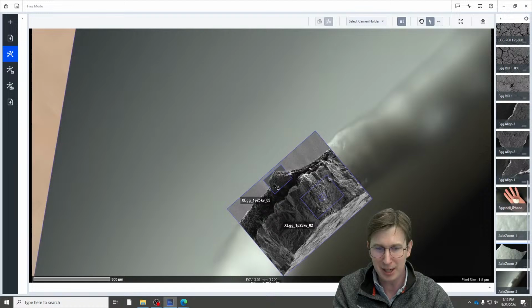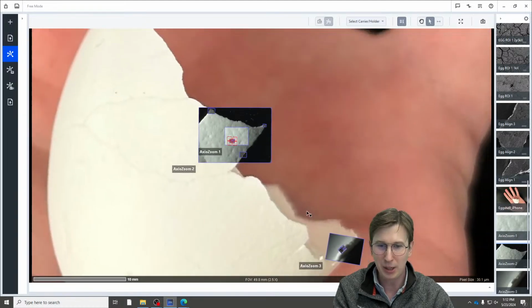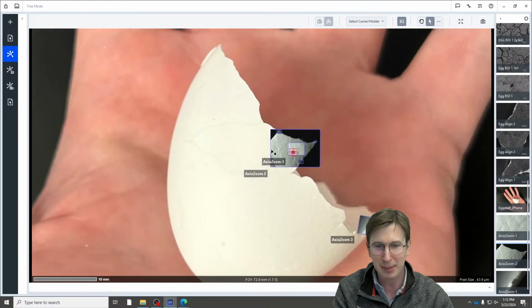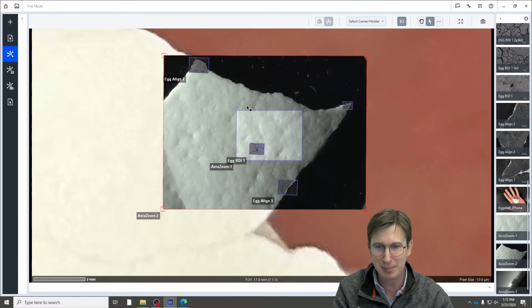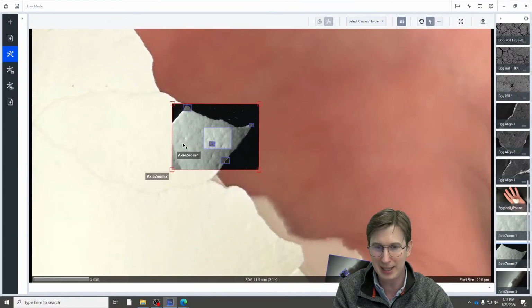Let me zoom out, and now let me talk a little bit about how we made the correlative microscopy. So I already mentioned, right, this was an iPhone image. That doesn't have any pixel scaling, but what did was this initial image I took from the microscope. Now, with that image, I would position this iPhone image into where we see this.